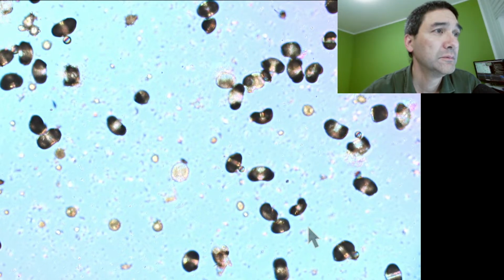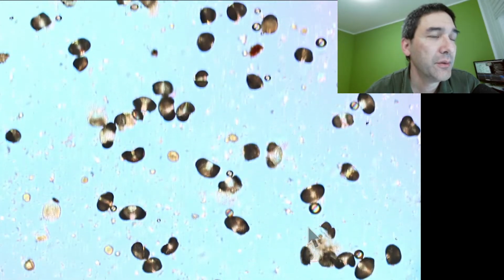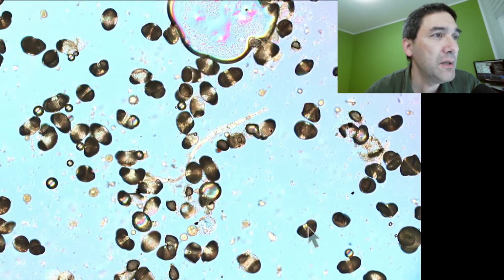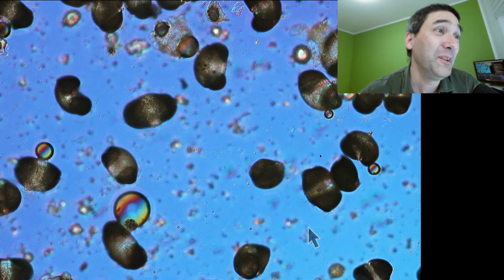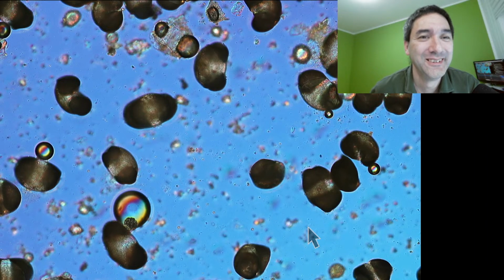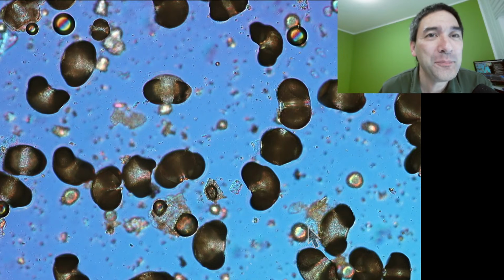Okay. Pollen, not sand, or at least mostly pollen. And a whole bunch of air bubbles right now. So that's basically the Sahara sand, which wasn't Sahara sand. But still looks kind of nice. So let me go through the comments here again.